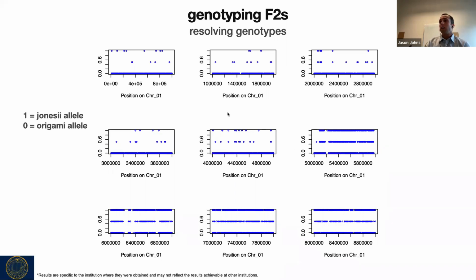And so what we've done here with all of these little graphs is broken it up into even smaller bins. We use this if we ever had a question about where a bin belonged or what the genotype was within a particular bin. We could zoom in within a bin and say that, well, it looks like this recombination event, rather than happening at the 5 megabase position on chromosome 1, actually happened a little closer to 5.1 megabases or 5.2 megabases, whatever that may be.